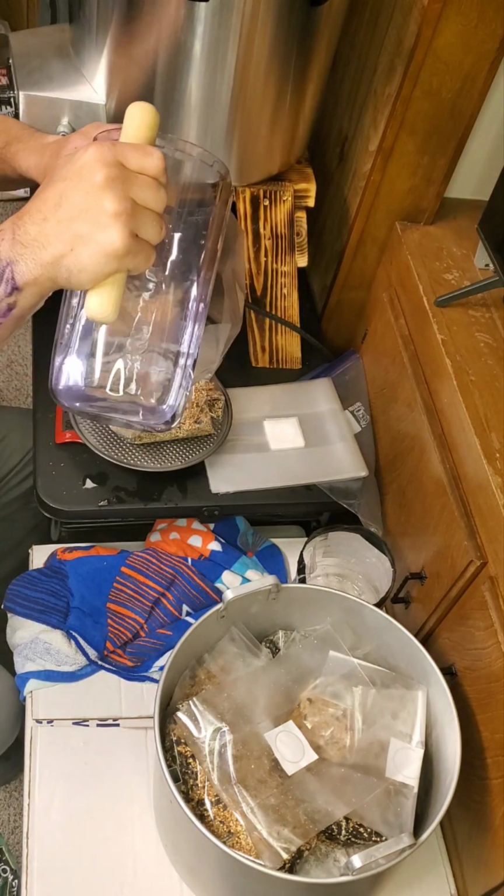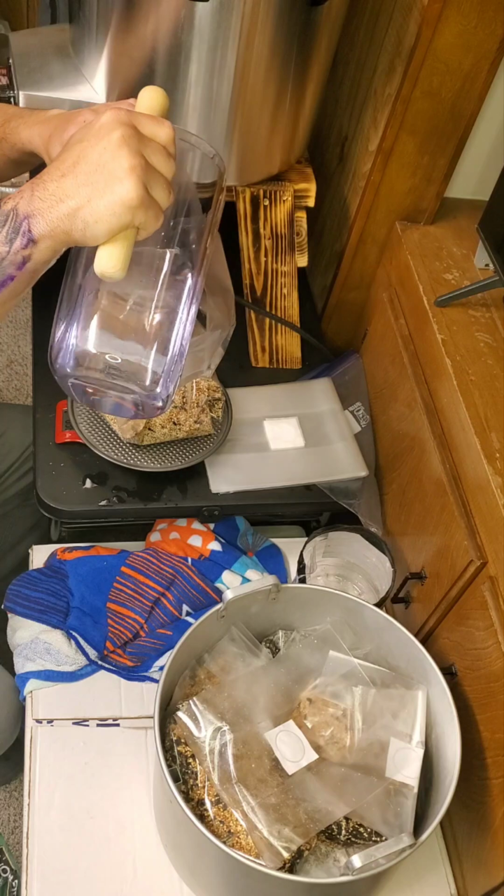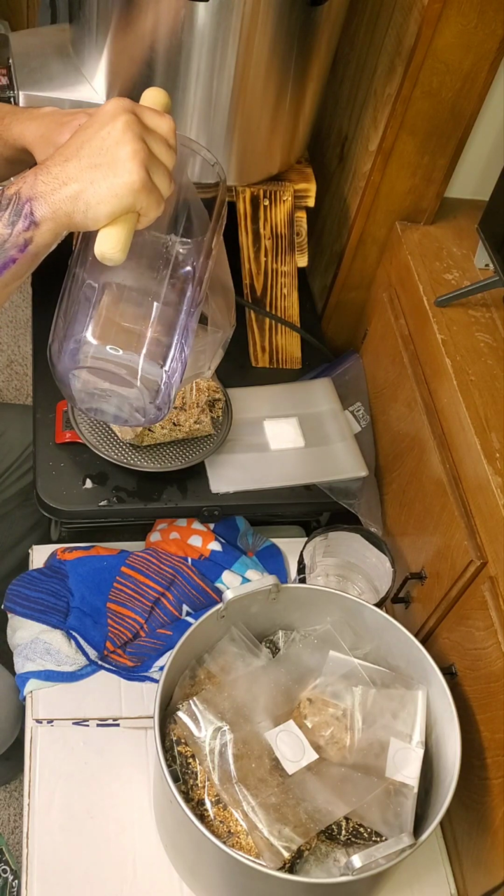So we'll probably just put about 500 grams, 450 grams, and bring some up to 1273 to see what it looks like.